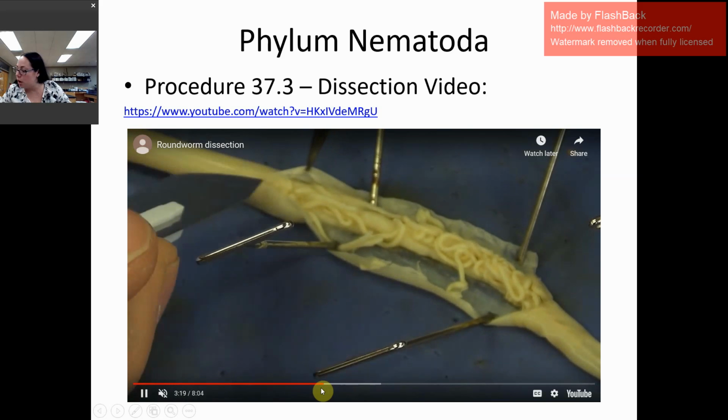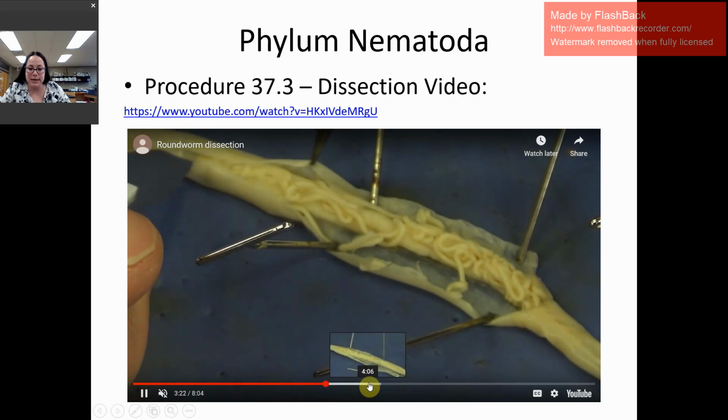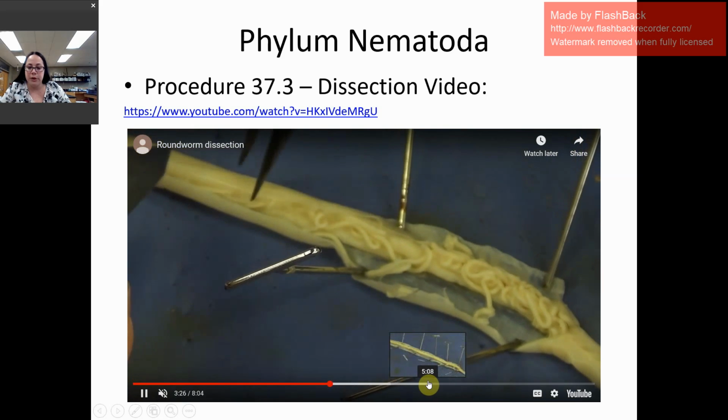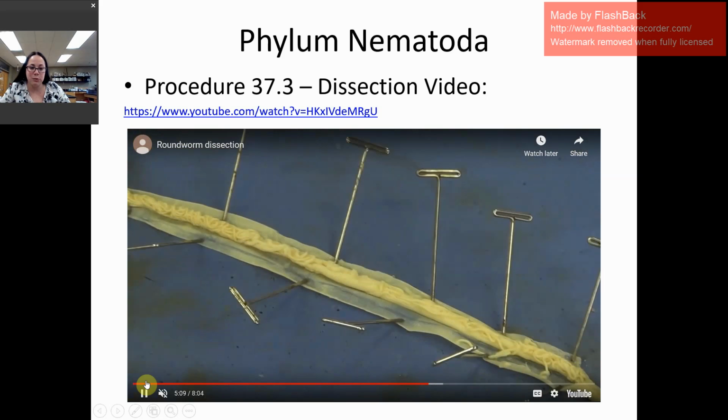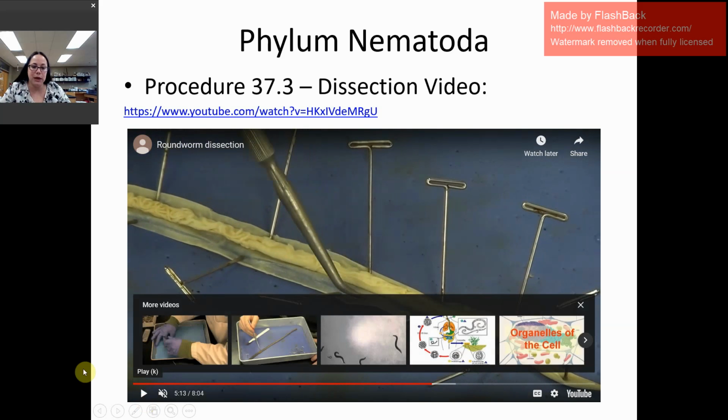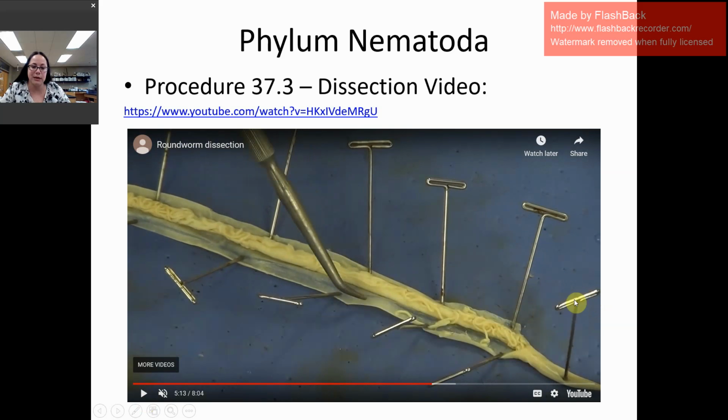organs. I'm going to go all the way up to 5:10. You can watch the whole video if you want. 5:10, almost. Okay, this is most of the worm that he opened. Okay, I'm going to pause that for a second.